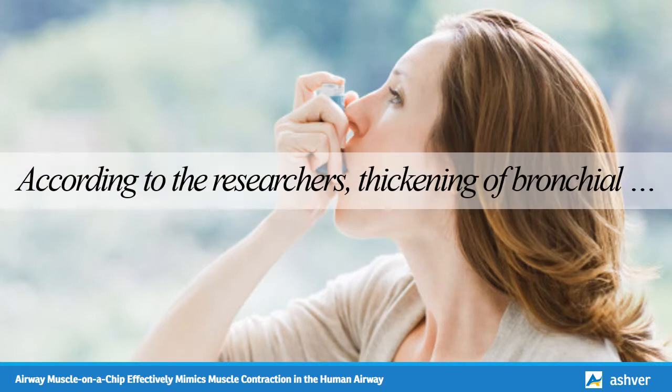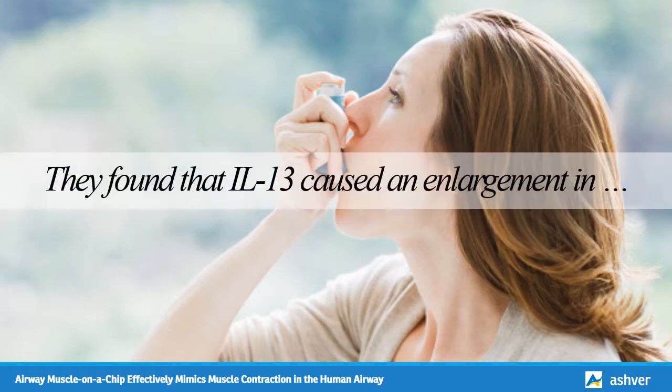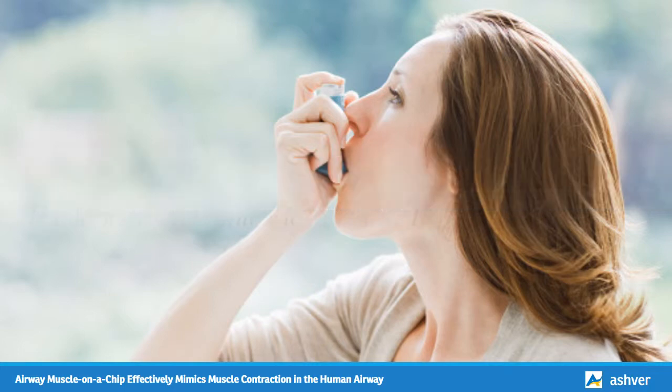According to the researchers, thickening of bronchial smooth muscle in the airway wall is a structural characteristic of asthma, causing the airway to narrow. Using the airway muscular chip, the team wanted to see whether IL-13 induced such a response on a cellular level. They found that IL-13 caused an enlargement in smooth muscle cells, and in addition, modified the organization of actin fibers in these cells, cellular components that play a role in muscle contraction.